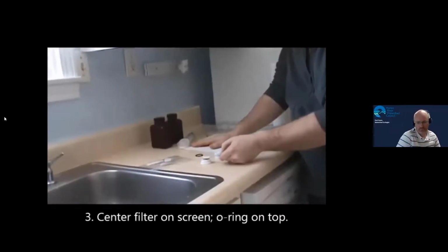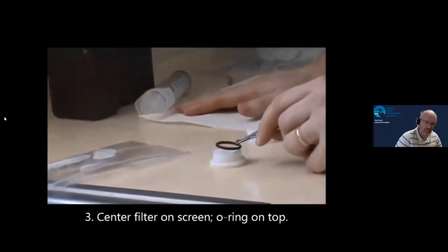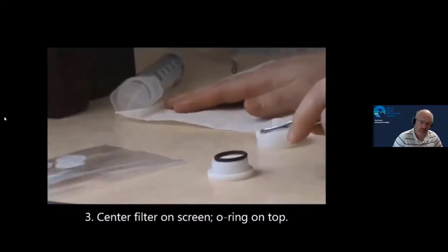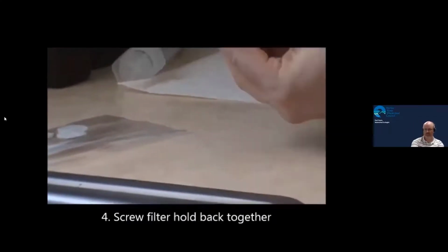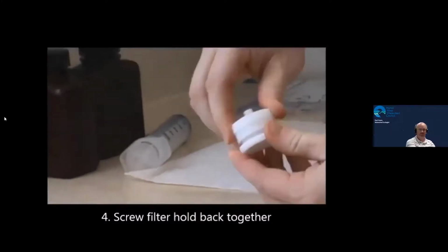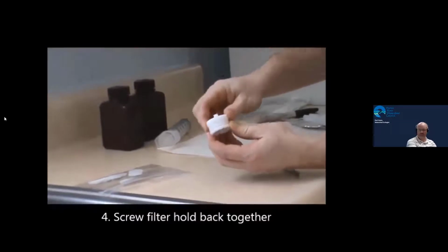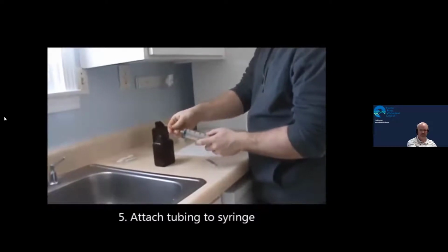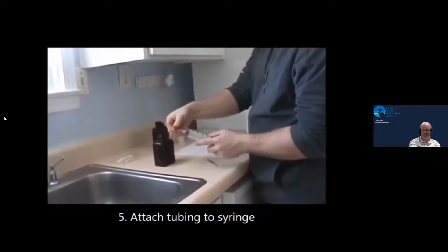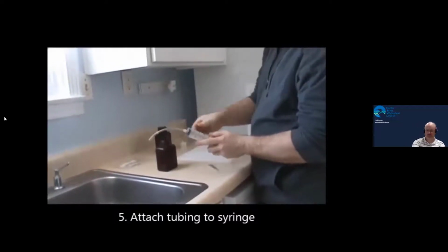Center the filter on the screen and place the O-ring on top of the filter. Screw the filter holder back together until it is moderately tight and place it to the side for the moment. Grab the syringe and the small piece of clear plastic tubing. You can push the tubing onto the syringe. It doesn't fit perfectly, but it will not slip off if you work at it.